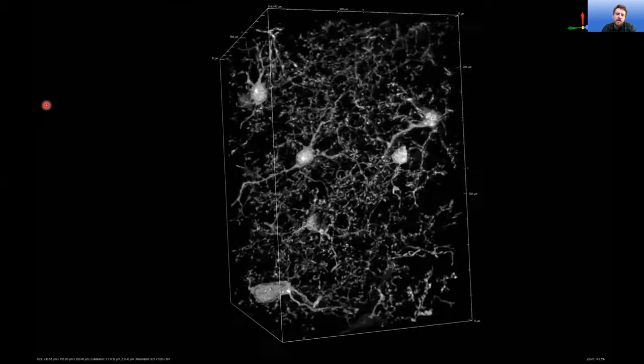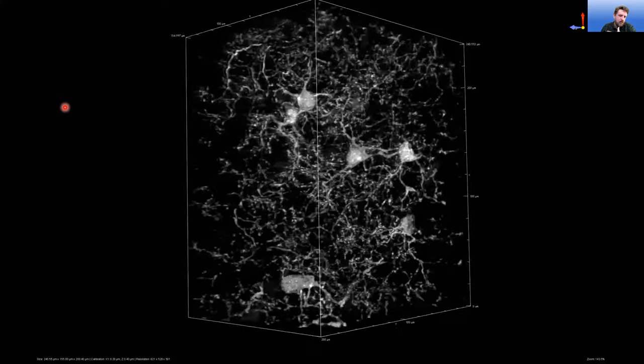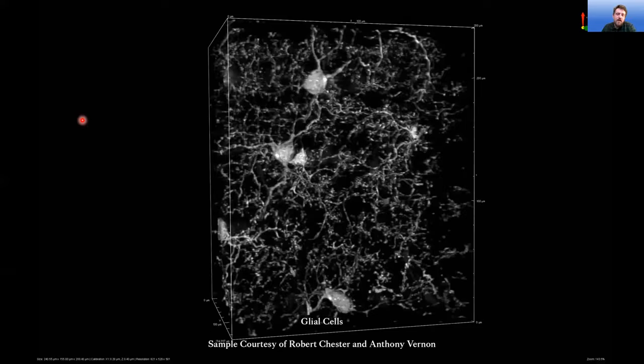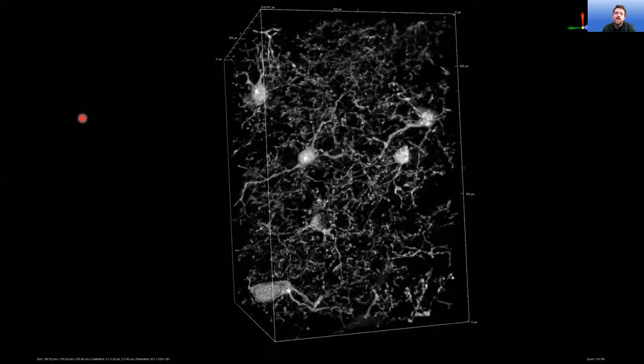And I think it's worth keeping that in mind as well, that you can take a brain region and then scan this and see what the cells are like and keep them in context. That is really something that's worth underlining, is the context.